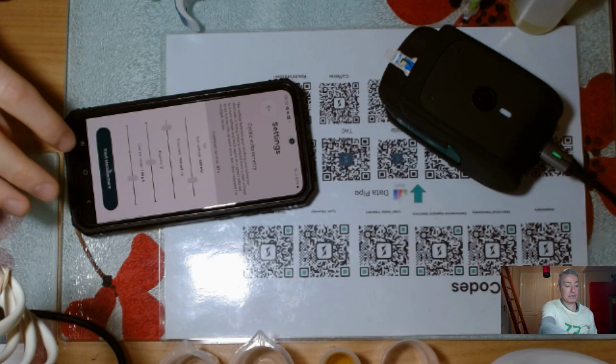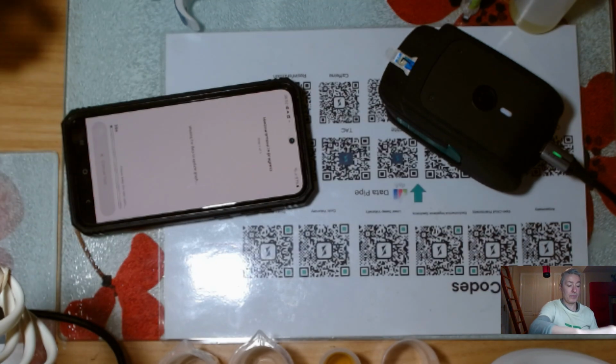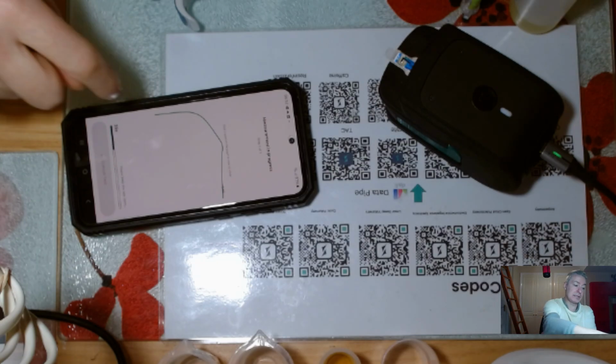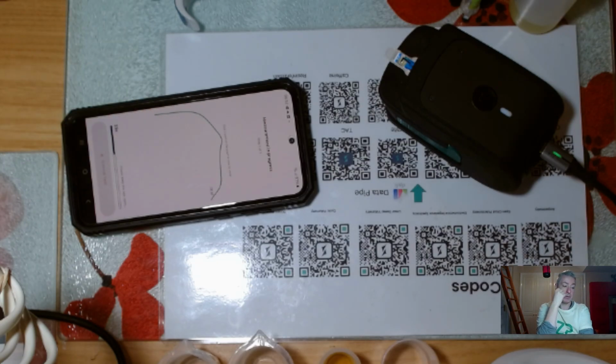And we actually use cyclovoltammetry a lot when we're trying to prove to ourselves that our manufacturing is essentially reproducible. So what I'm doing here now is gathering its current versus time. Most cyclovoltammetry is shown as current versus potential, which I will also do. But it's actually gathered as current versus time. It's just people don't see it in that perspective.